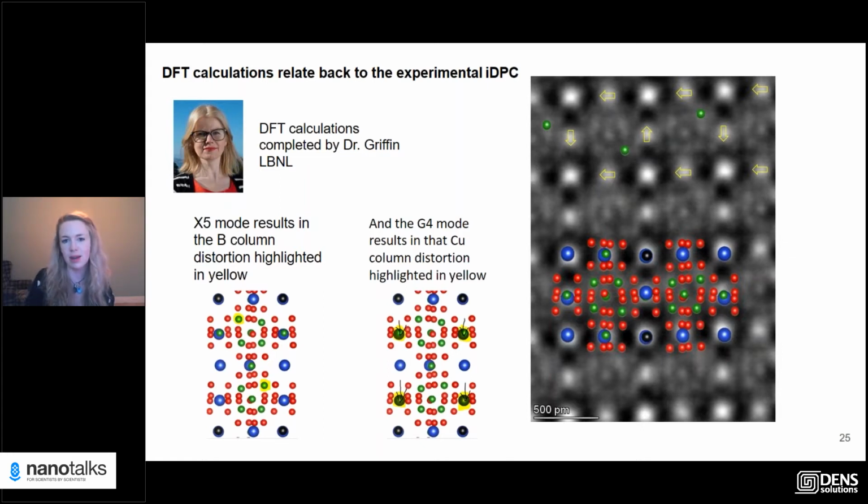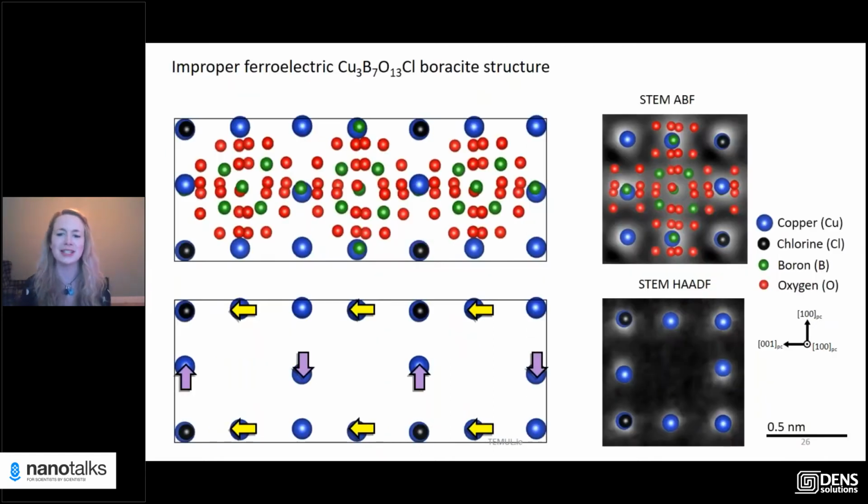But also, to confirm that experimentally, we didn't just use STEM HAADF atomically, we also used STEM iDPC. With that, we were able to map out those lighter atomic columns as well. Now, long term, we realized we don't actually need to understand those lighter atomic columns once we can confirm that they move in this way when the heavy atoms move in that way. So now we can move on and say, yeah, we're happy, experimentally it links perfectly with theory. Great, let's move on. Let's make it more simple for ourselves. You can see down at the bottom right, that's really the most important, the STEM HAADF. So for the rest of the talk, it'll all be in STEM HAADF.